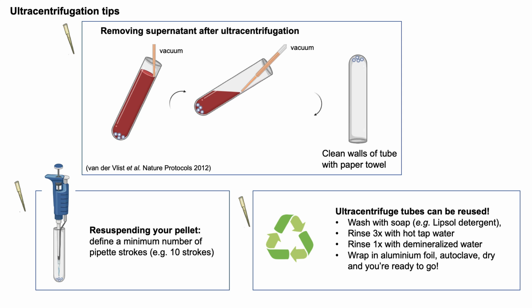Here's a budget tip. Did you know that you can reuse your ultracentrifuge tubes? You can wash these with soap, and then by a thorough washing with hot water and demi water, and even autoclaving them afterwards, you can recycle your tubes up to 5 times. And I've done this all the way through my PhD working on RNA. Never had any problems. So this could be useful.